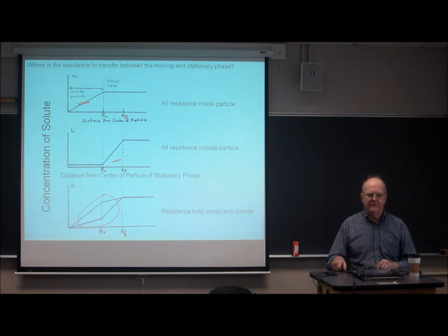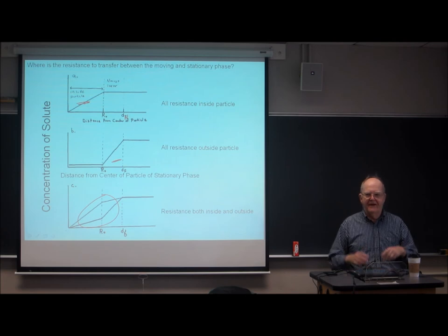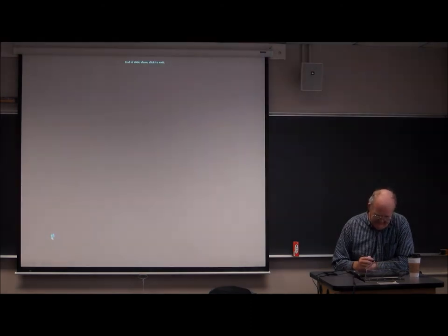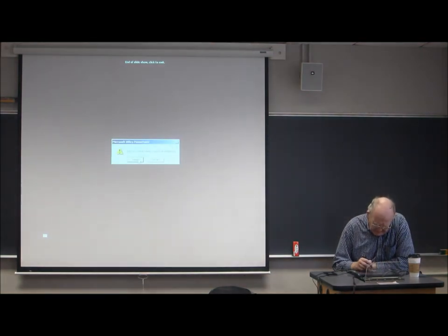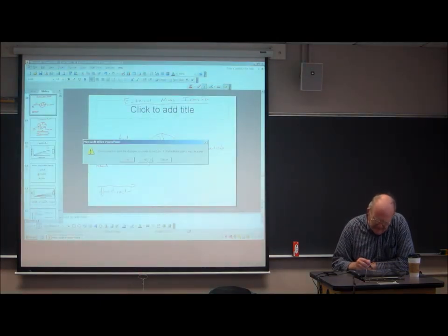In liquid chromatography, the moving phase and the stationary phase have roughly the same diffusion coefficients. It depends on exactly the circumstances as to who's going to be the bigger problem. So you have to make everything small. So that finishes up our discussion of the mass transfer resistance in a packed bed.